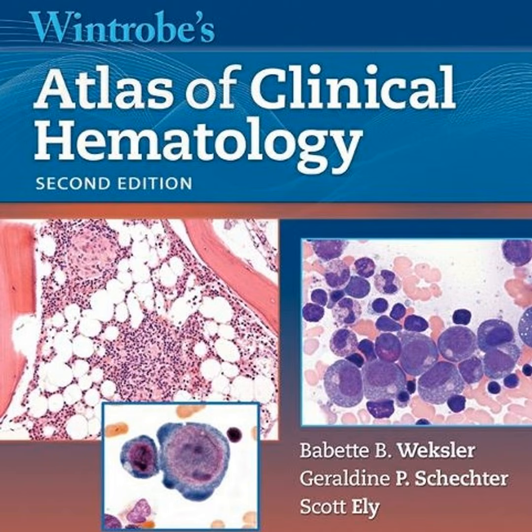So you gate on that bright CD38, dim CD45 population and then look for those weird patterns. That's exactly how it's done. Okay, moving from liquid analysis back to the slide.